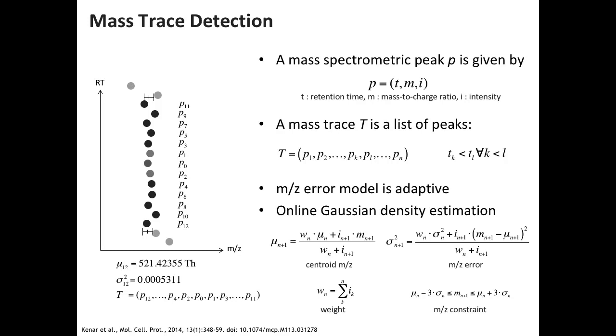So also, don't you have a higher ppm error bias in the lower mass ranges? Right, but that's why it's in ppm, because it's a relative mass error. Yeah, so it's not an absolute threshold.